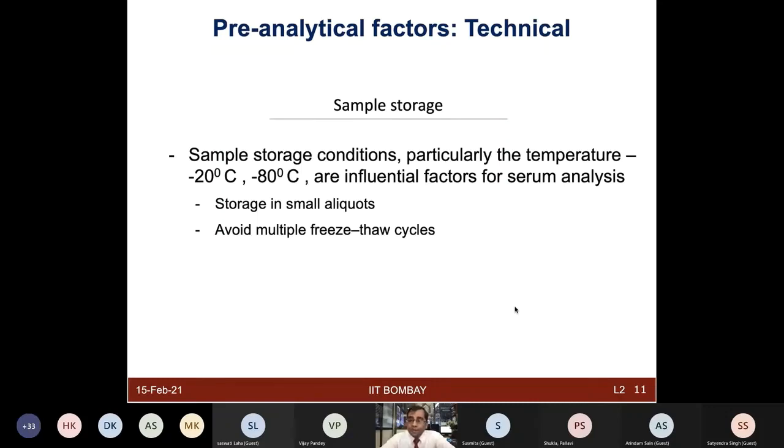a bigger experiment. And there's a lot of investment which goes into doing proteomics or any other omics based experiment. But many times you are introducing a lot of variability at the pre-analytical level itself, which no technology can actually correct. Because I was talking to you about thinking about experimental design and adding some sort of internal standard, adding certain pools, looking for things which can monitor the chromatography reproducibility.